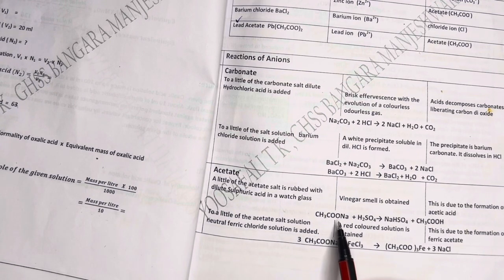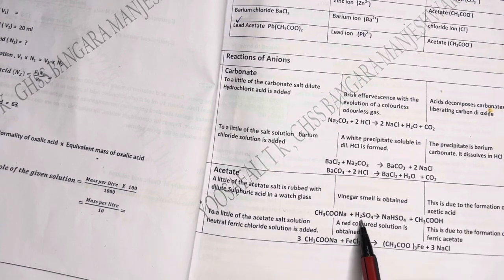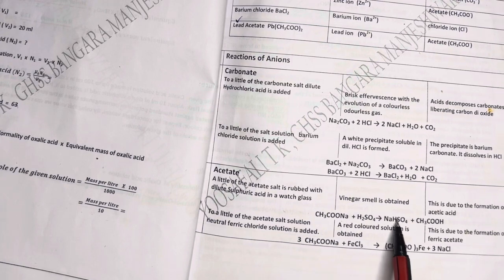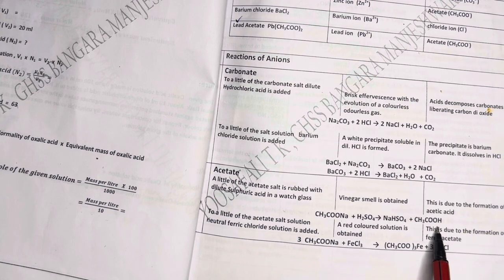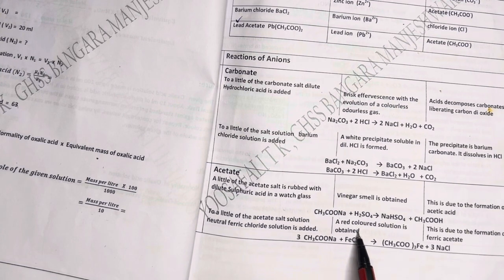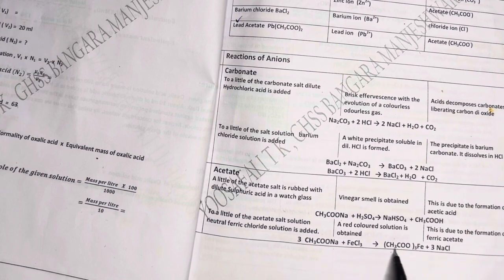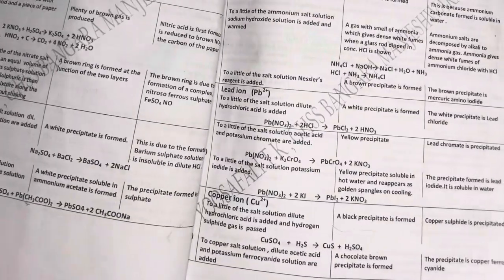So CH3COONa is our salt, that is, the acetate salt. When this acetate salt is treated with sulfuric acid, NaHSO4 plus CH3COOH will be formed. Again, to a little of the acetate salt solution, neutral ferric chloride solution is added. When you add neutral ferric chloride, a red colored solution is obtained. This indicates the formation of ferric acetate. So this is a reaction. When the sodium salt is treated with the ferric chloride, you will get this compound along with NaCl.